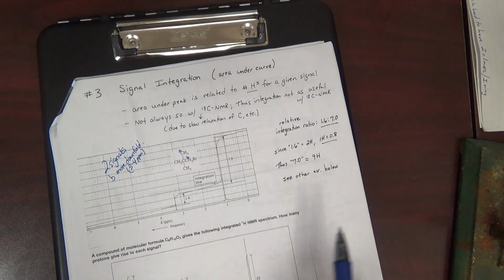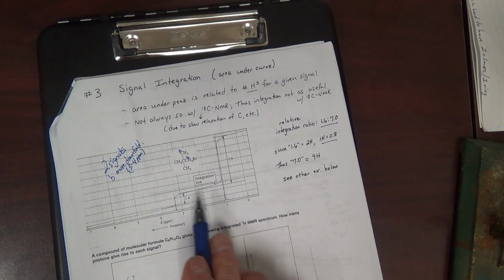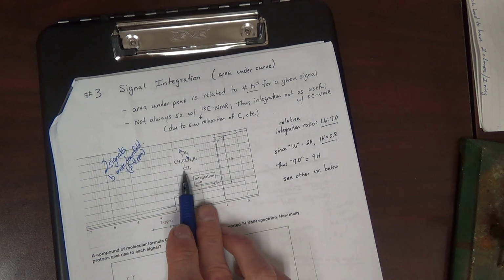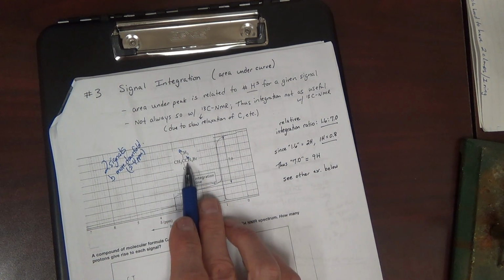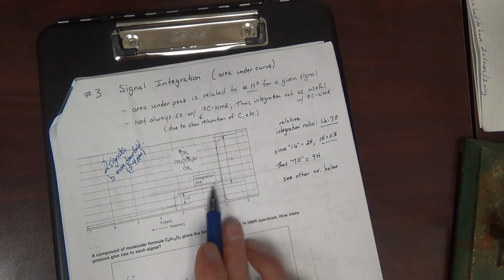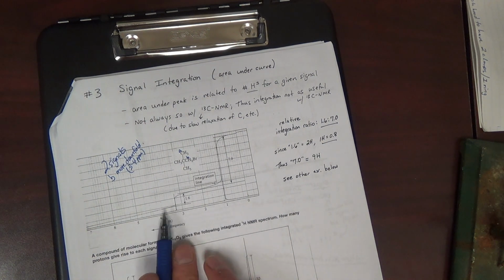Let's make sure we have two signals. Indeed we do. Two signals. One of them is more in the 3 to 4 range. Indeed it is. The other is sort of removed from the electron withdrawing group. It's going to be more upfield. Now it's actually twice removed, because the H's are not on the next carbon, but on the one after. So pretty much it's gotten us back down to that one range where standard alkane CHs give peaks. Okay, so that covers number of signals and peak position.